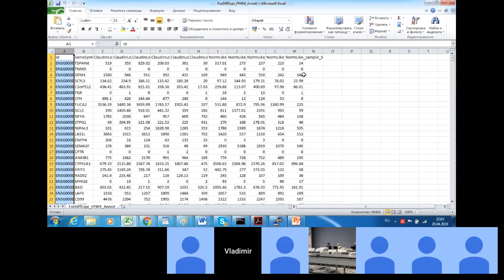So what is the standard pipeline, the standard set of steps for differential expression analysis if we limit ourselves to very simple statistics? Again, first, standardly, we go from linear scale to logarithmic scale to be able to apply various parametric statistical models, for example, t-test.